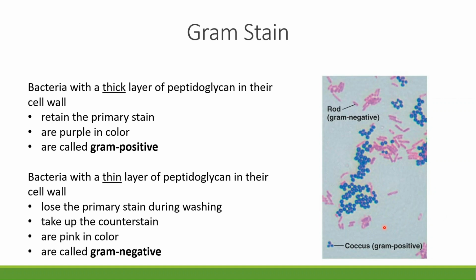But why do some bacteria stain Gram-positive and others stain Gram-negative, and why are we so concerned with this? Well, this actually gets to the thickness of their peptidoglycan layer. Organisms that have a very thick peptidoglycan layer, Gram-positive organisms, are very good at retaining that crystal violet iodine complex, whereas organisms with very thin peptidoglycan layers are very easily destained using our alcohol wash.